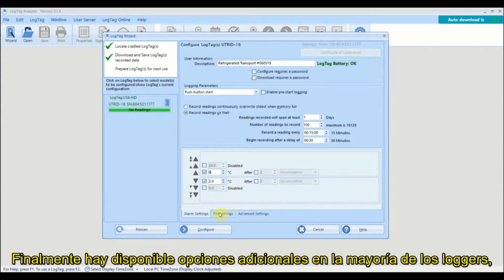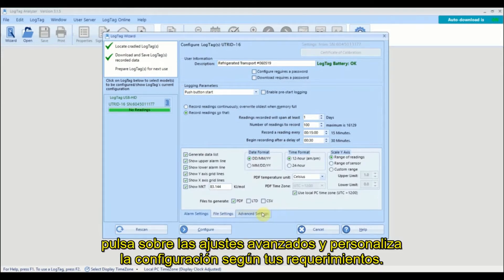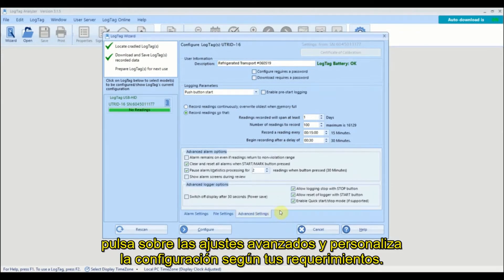Finally there are additional options available on most loggers by clicking on a tab and customizing the settings to meet your requirements.